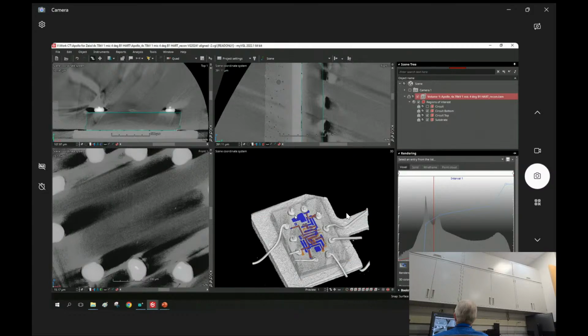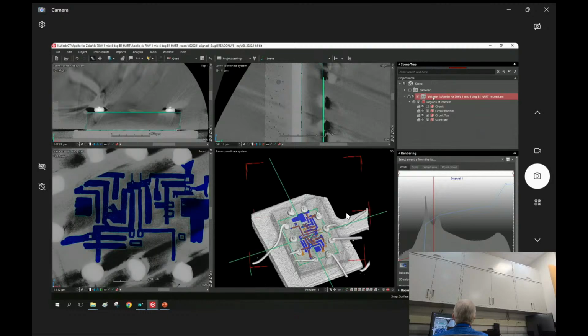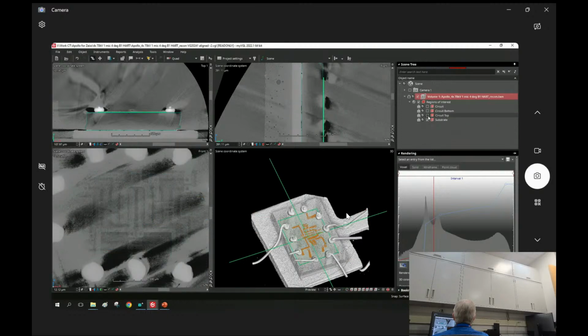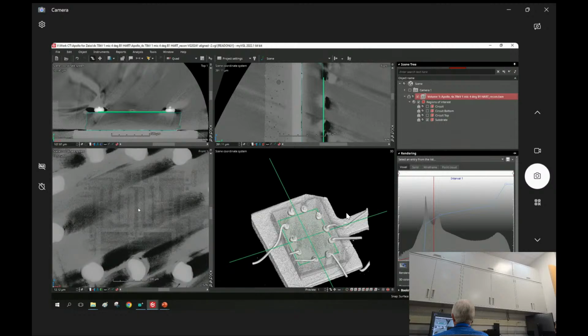What was I saying about low density things versus high density things before? So the only way I was able to do this, and it is a trick, and I actually have a patent on it, is by putting another material in contact with this that will absorb some of those scattered X-rays locally.